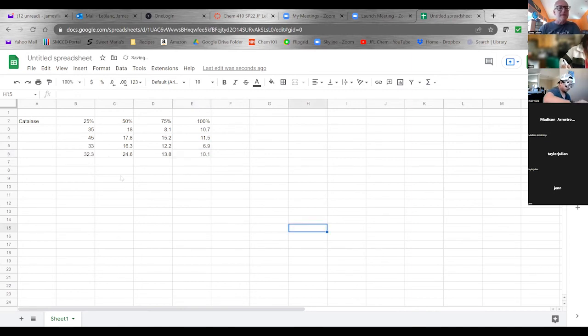All right, let's plot these out, see what they look like. Of course, that's time, and I actually want millimeters per second.